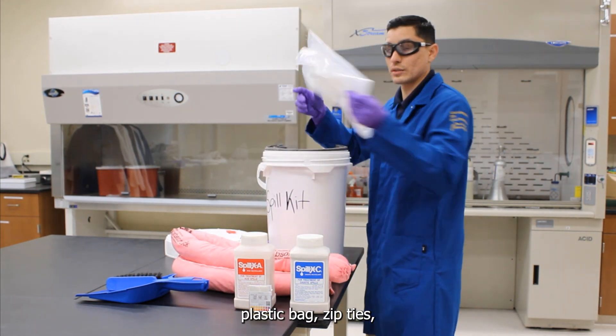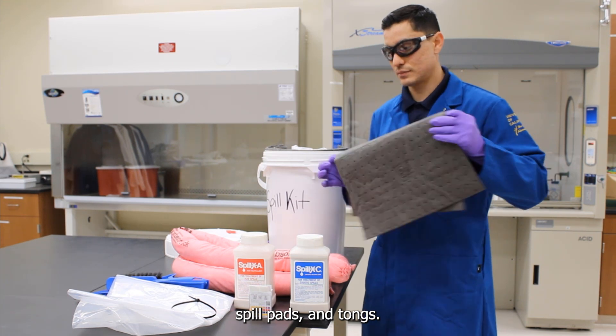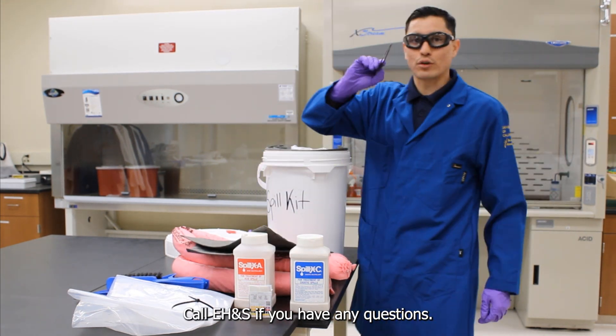The spill kit should also include a plastic bag, zip ties, spill pads, and tongs. Call EH&S if you have any questions.